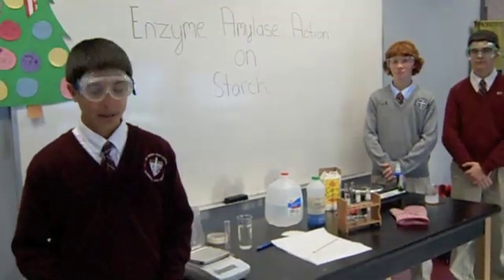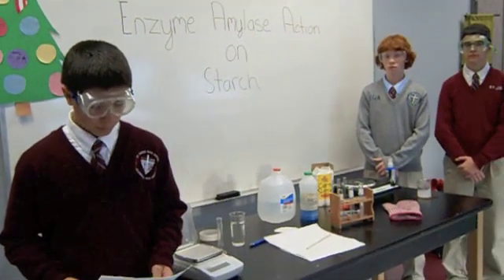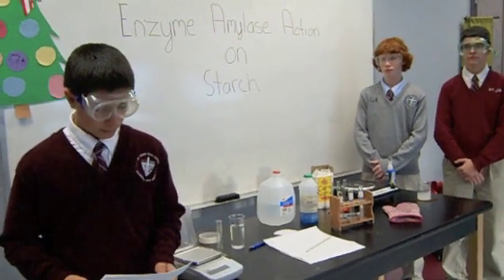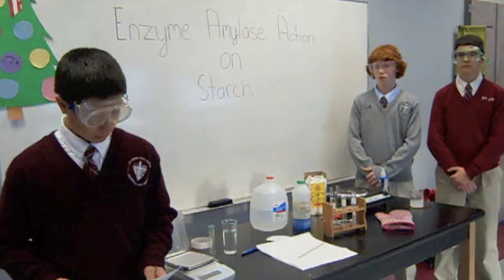We are doing the enzyme amylase action on starch experiment. We will observe the action of the enzyme amylase on starch. Amylase changes starch into a simpler form, the sugar maltose, which is soluble in water.